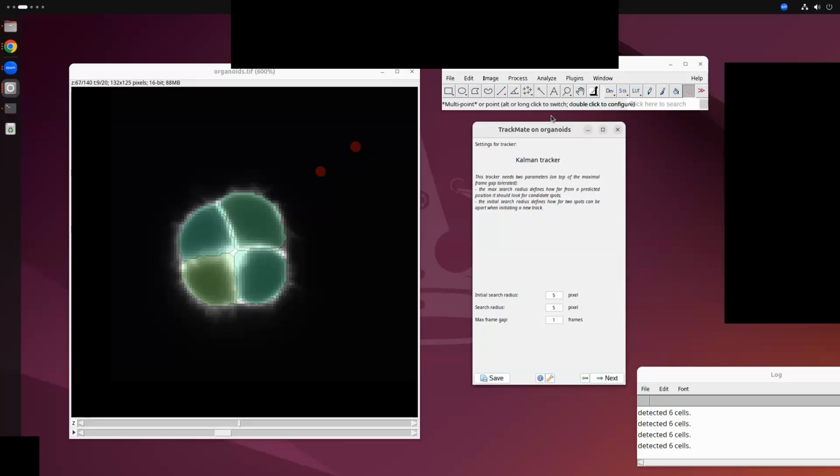If you're unhappy with it, you can do some local pre-processing if you want. Generally, in my experience, those rarely help that much. If the model does not understand your image semantics, it's not because the image is blurry. It's because it hasn't seen a cell shape or the specific staining pattern you had in your data yet.